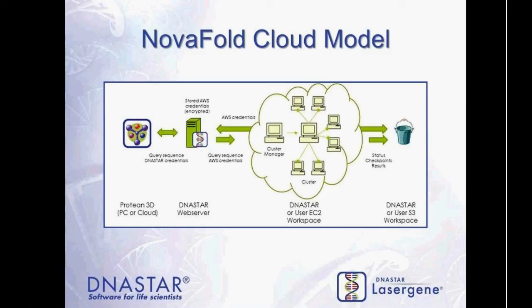In the future, we're going to continue to improve this code with the collaboration of Zhang. Over time, DNASTAR hopes to improve the accuracy of the program even further, as well as diverge to provide you with additional structure prediction analysis options.